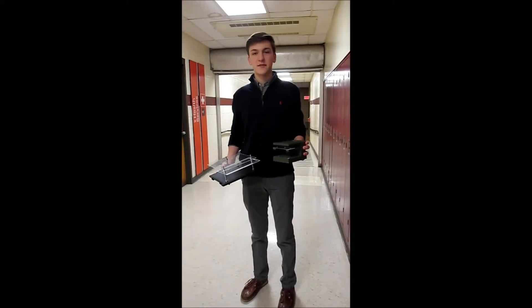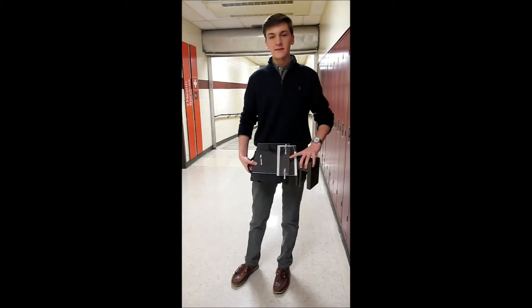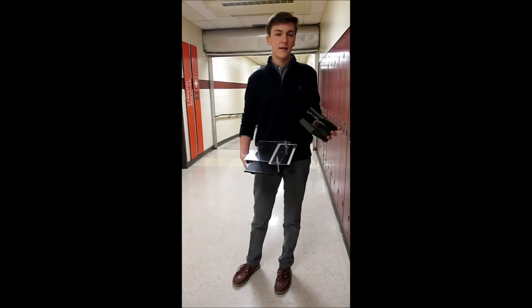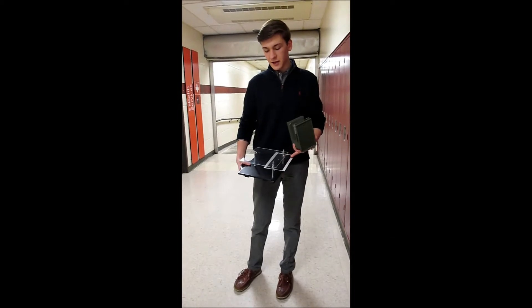This is the cell phone microscope. This is the initial prototype that I made using a 3D printer, modeling base, plexiglass, and bolts. The lens is an acrylic lens that is compounded with the camera lens in the phone in order to magnify whatever's on the slide below it.